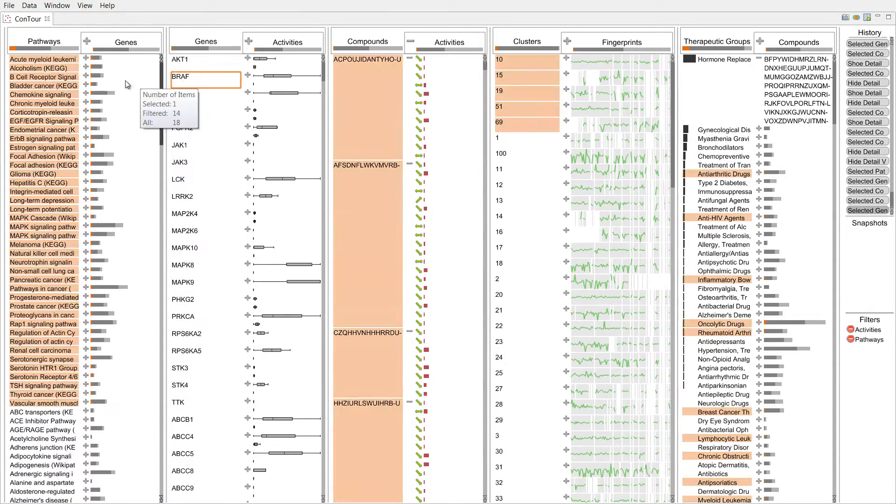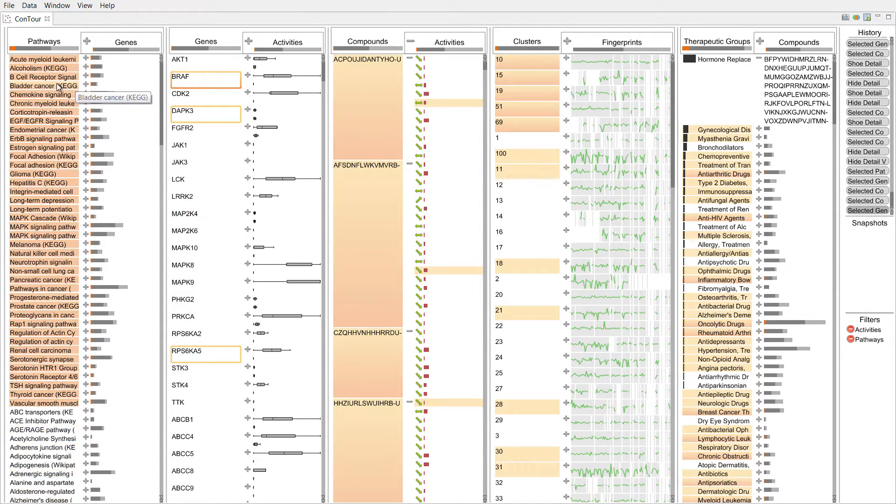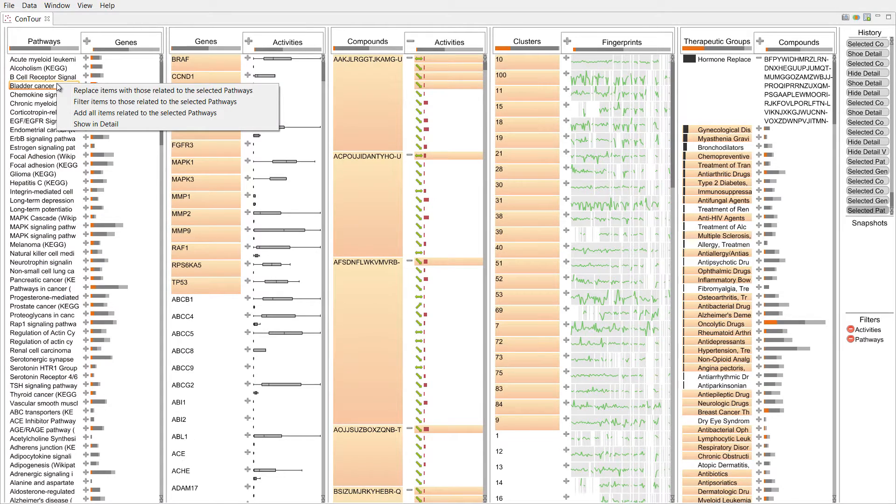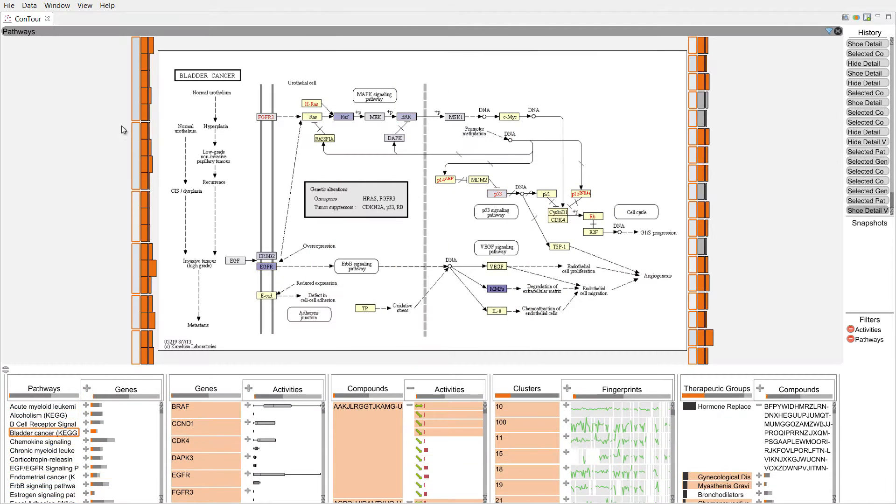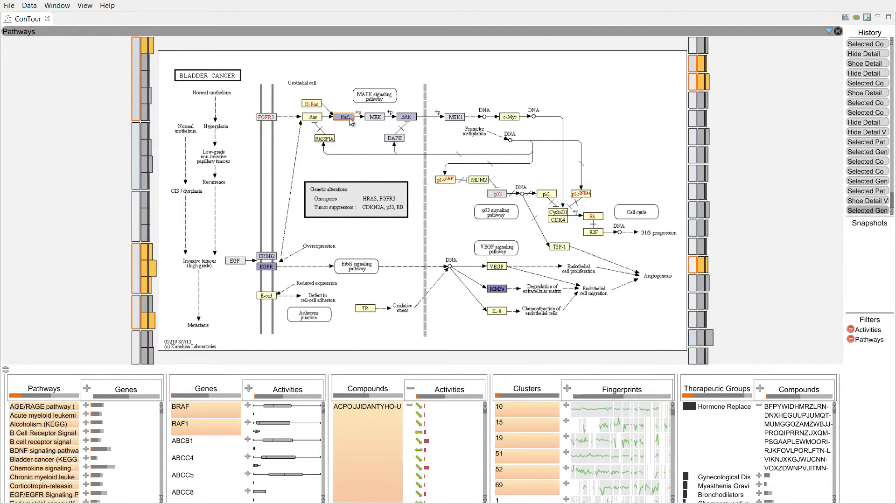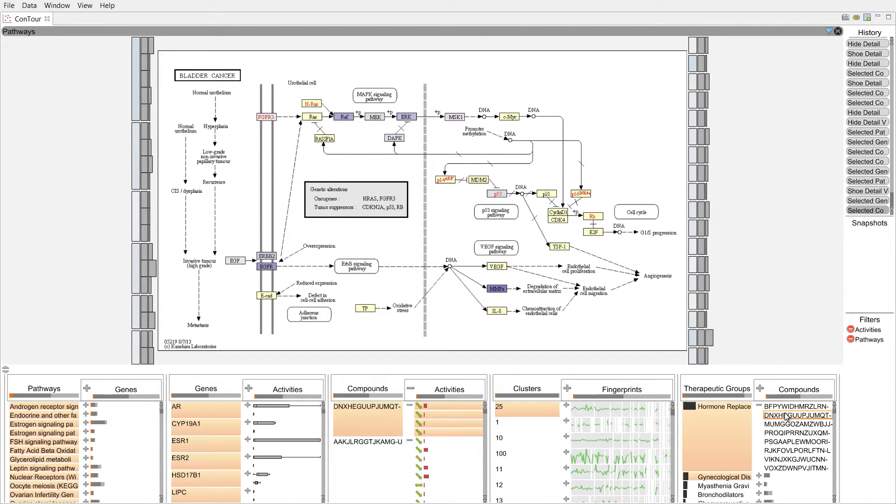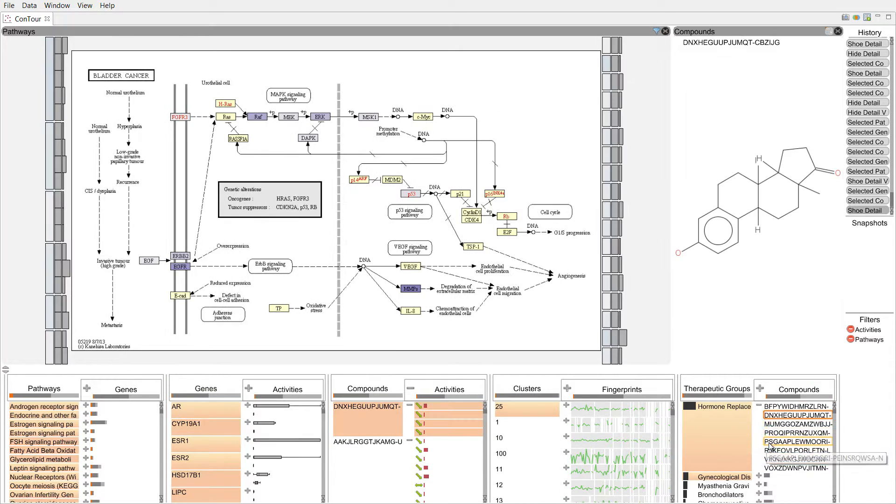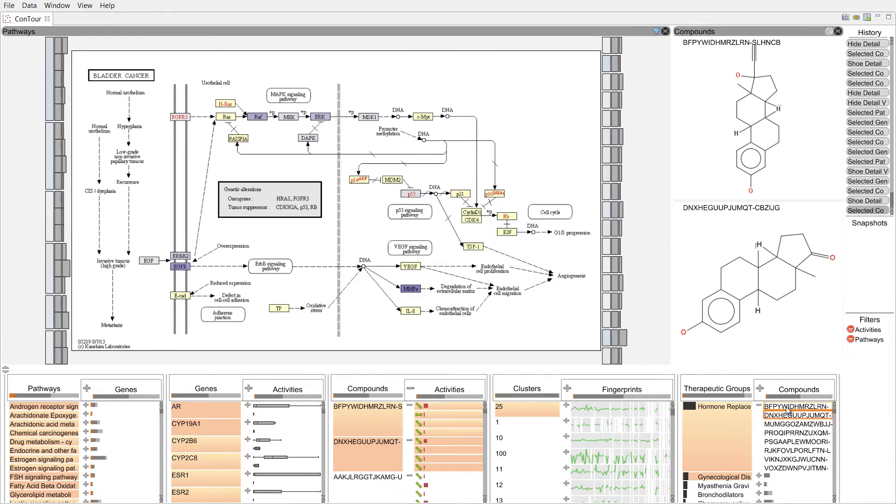ConTour is all about finding important relationships, but can also show detailed visualizations about the items. Here we see a pathway view and several compounds. But let's start from the beginning.